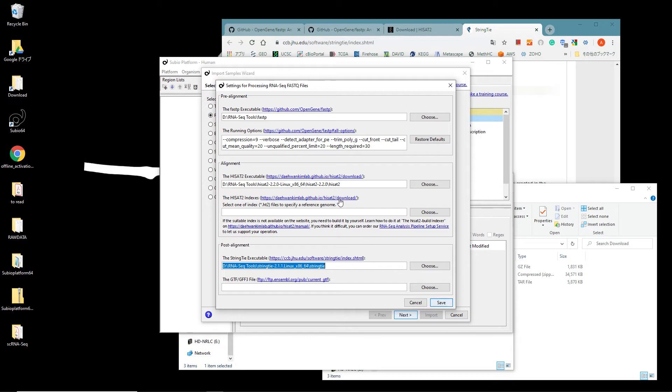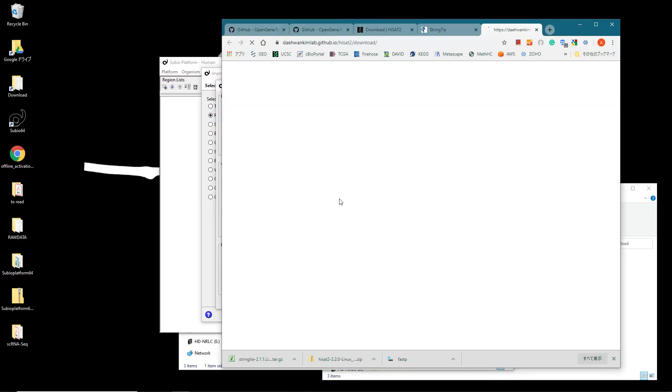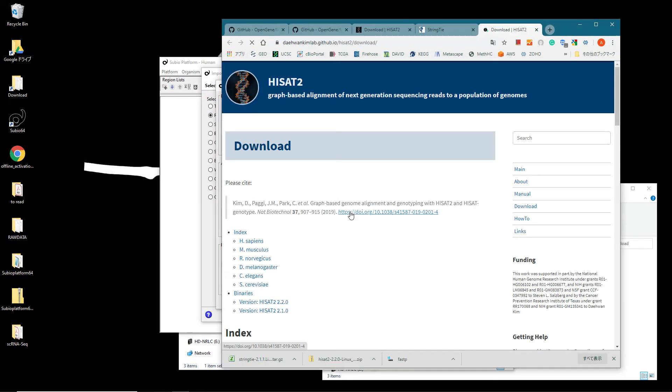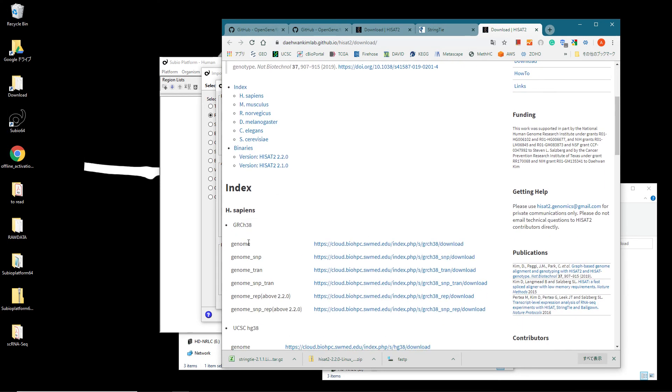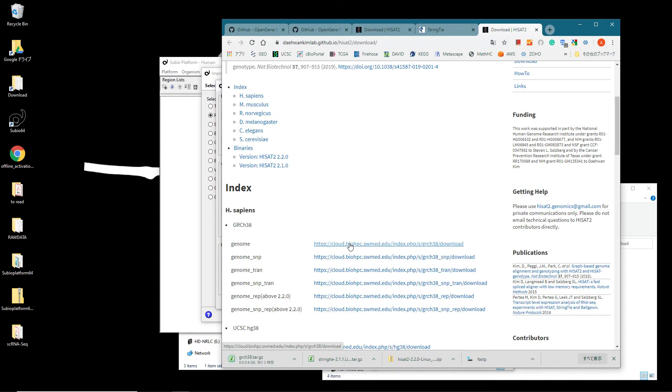Click the link at the HISAT2 indexes section and click the link at the genome of the GRCH38 version. It takes a while, so let it keep downloading.